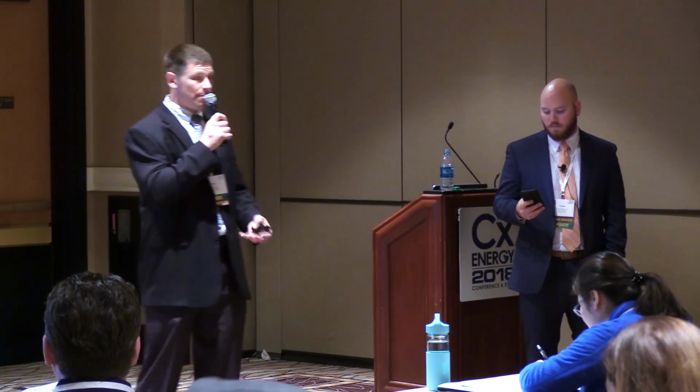So now, yes, your air velocity is measuring correctly across your fume hood, and that's fantastic. And you're meeting your air change rates when your fume hood's wide open, that's great, but your BAS has no idea what the actual airflow is doing, and therefore it cannot control the general exhaust or the supply air to make your pressurization. So what we typically find is that these things are quite a bit out of whack, and you come in and you're not getting pressurization. It's when you start to really have a lot of pressurization issues, or your supply air can't keep up and you can't maintain your temperature and your humidity control, that's when they call us in, but that's several years down the line after this has compounded for so long.